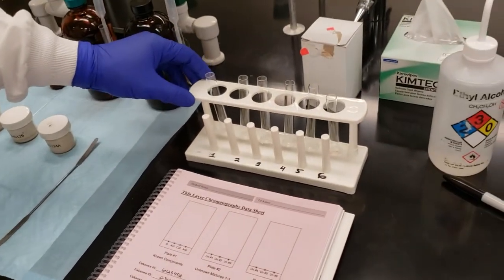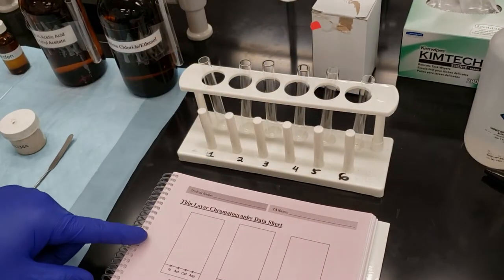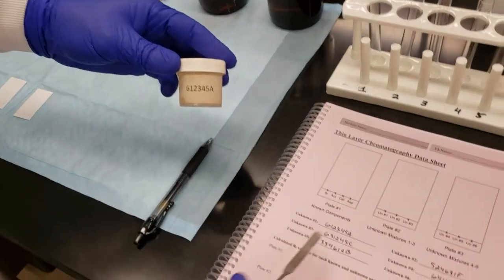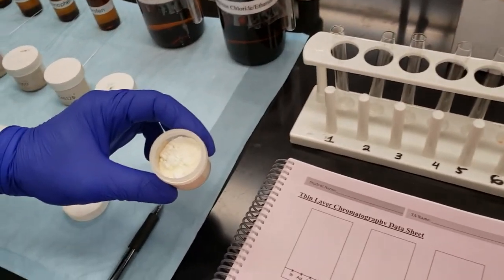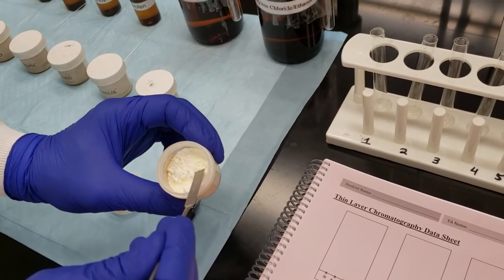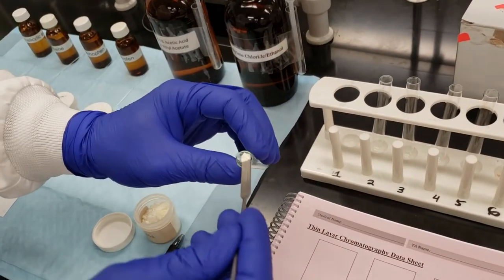Now we have to make up our spotting solutions, so we're going to stay very organized. We have our lanes marked. This is test tube 1 through 6, and that will correspond, of course, to our unknowns. I'm going to take a spatula. Take unknown number 1, right? Make sure that we're corresponding. Have to be very careful. And we'll take a look at the powder. Yellowish white powdery substance with a little bit of chunks. I'm going to go to the powdery portion right here, and we're just going to take the tip of a spatula and we're going to put it into our test tube.